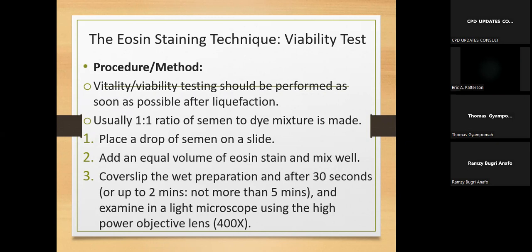this one we are saying that eosin, even though the technique is supposed to be supravital staining, take note, eosin is not a supravital stain, and therefore it cannot stain living cells. But using the principle of dye exclusion, that I'm not dead, I will not allow you to stain. Those who are dead, they cannot speak. So as for them, you can go and stain. Understand how? So you are using it to differentiate between dead and cells that are alive.